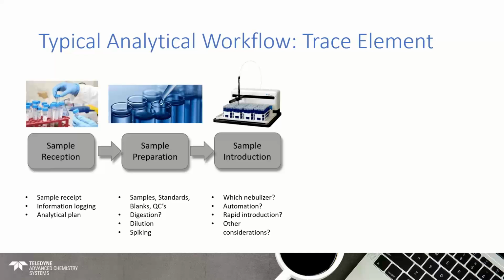So we take our prepared samples. There are certain questions to ask next. Which nebulizer would we use? Is there a particular type that's best suited to the sample type that's been prepared? Do we need automation? If we have a large number of samples, then most likely the answer is yes. Do we have a rapid introduction system involved in that process? Maybe. That's certainly something that can improve efficiency. And then are there any other considerations for the introduction process, such as how do we do internal standardization? Are there additional gas flows involved? All of that kind of thing.